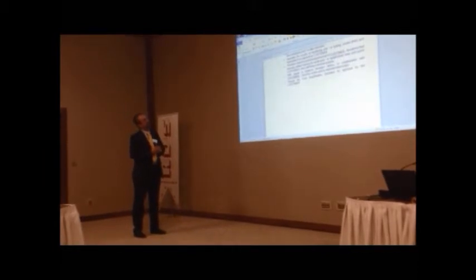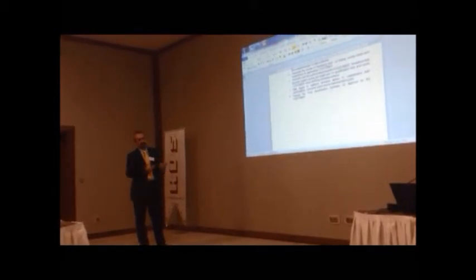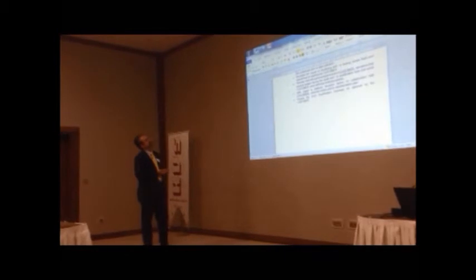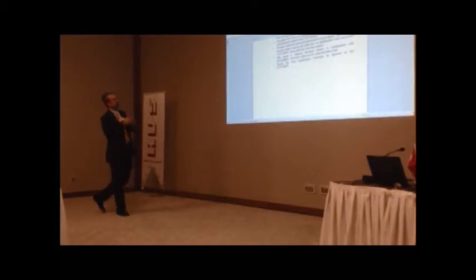Define the corrective action means suggest the corrective action with you, because we have some experience, so sometimes we can help you to find the solution, and prepare the final qualification summary for your approval.